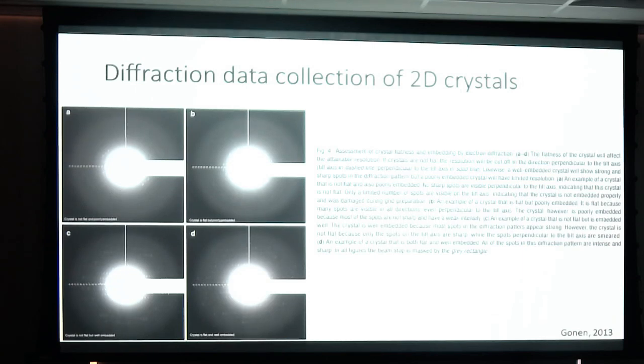But anyway, you would freeze it and then look for very flat crystals. The crystals have to be flat because any sort of bump in the crystal would mean there's a distortion in the 2D lattice, and you're relying on this 2D lattice in order to get a good reconstruction.